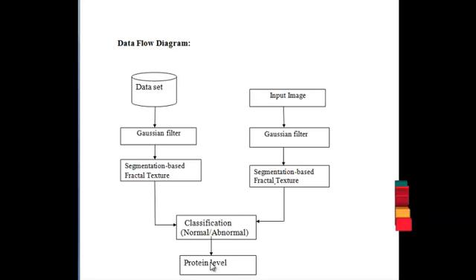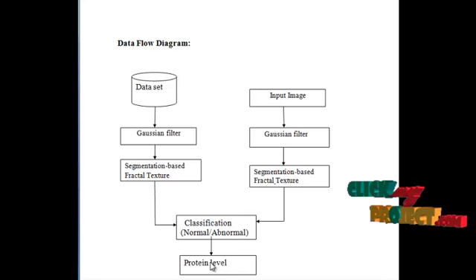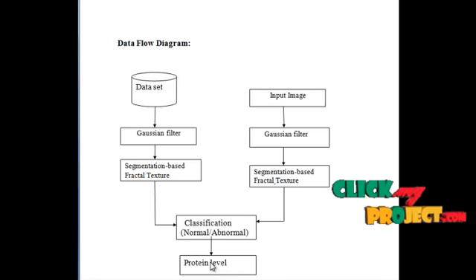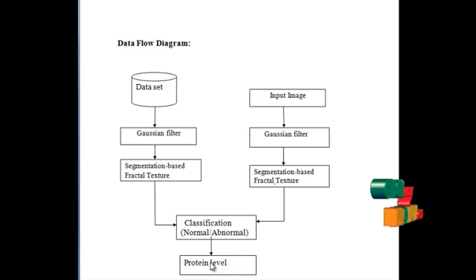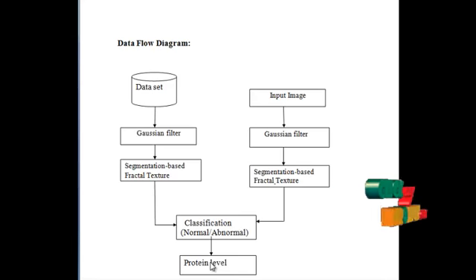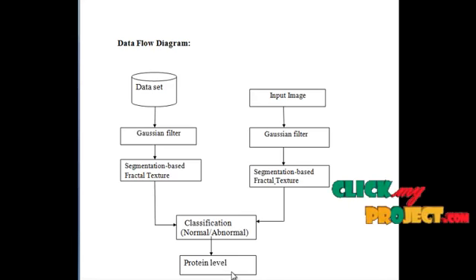The protein level technique is extracted from the tissues with a tissue extractor. Matrix disruption is often achieved in a laboratory setting by impact pulverization in liquid nitrogen. Samples are frozen in liquid nitrogen and subsequently subjected to impact or mechanical grinding.